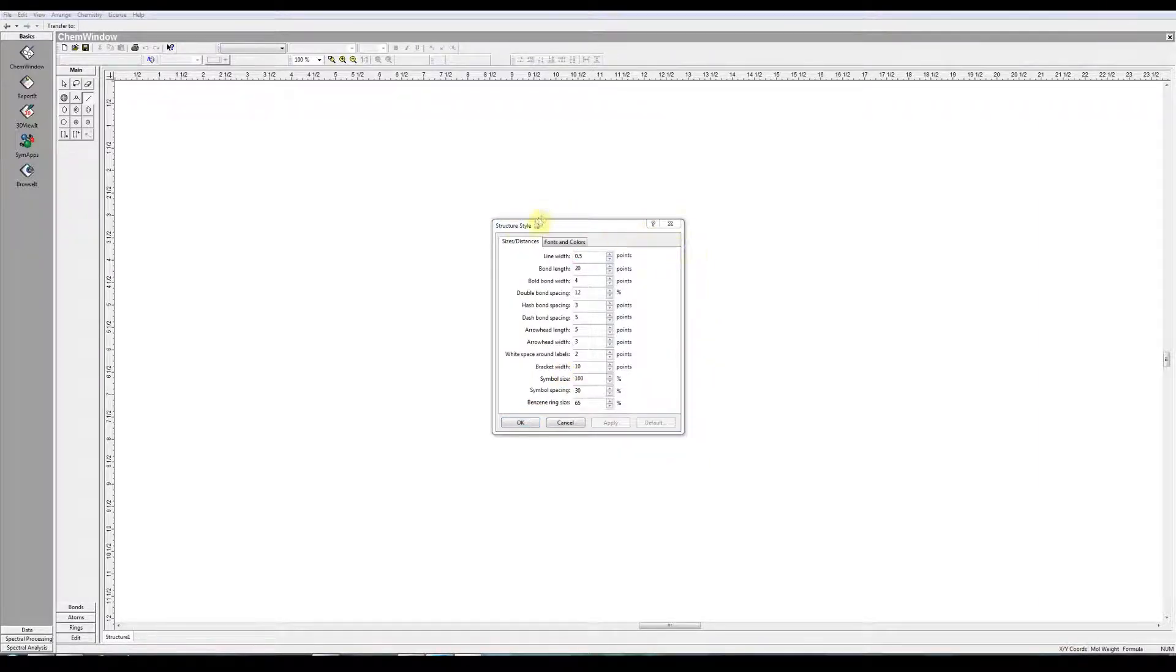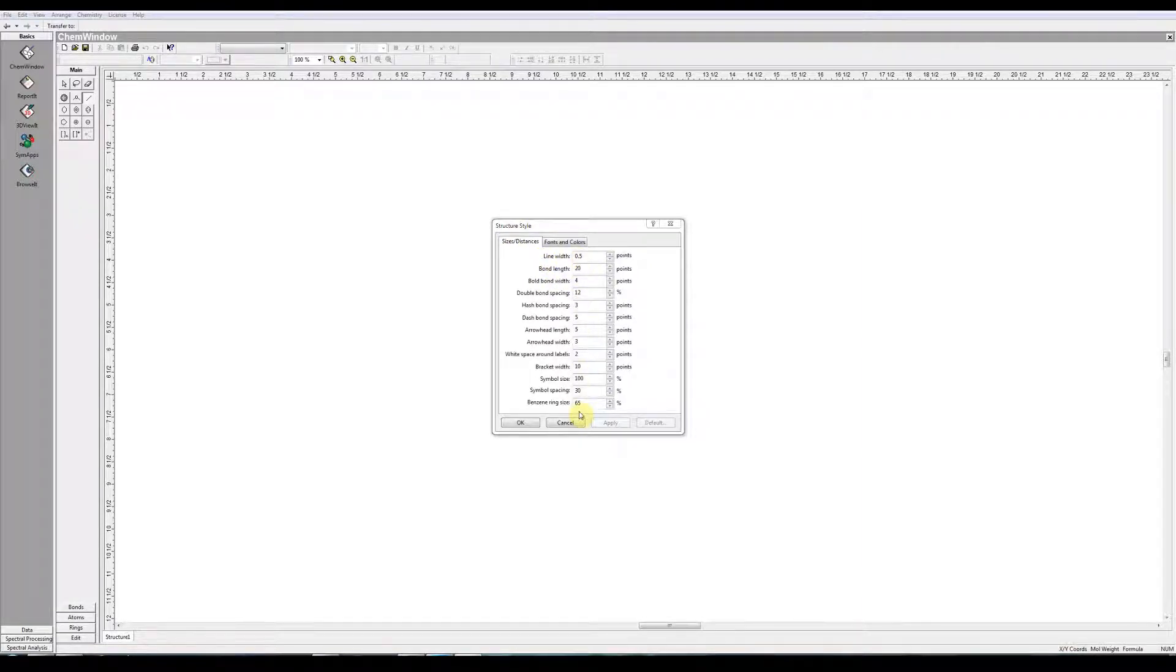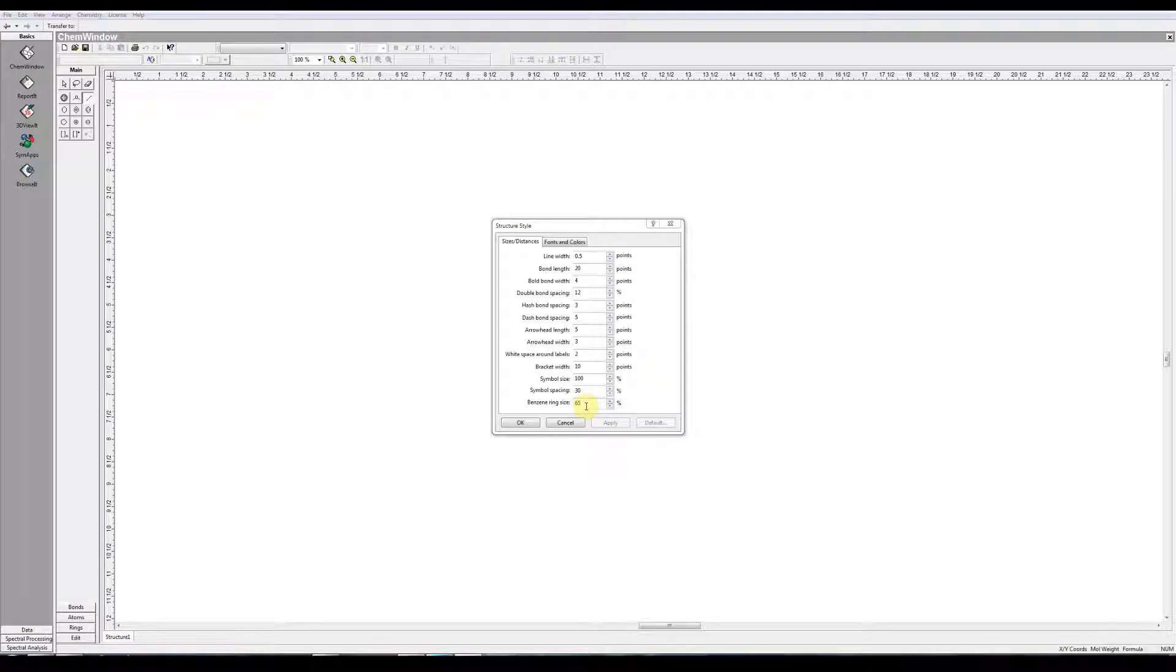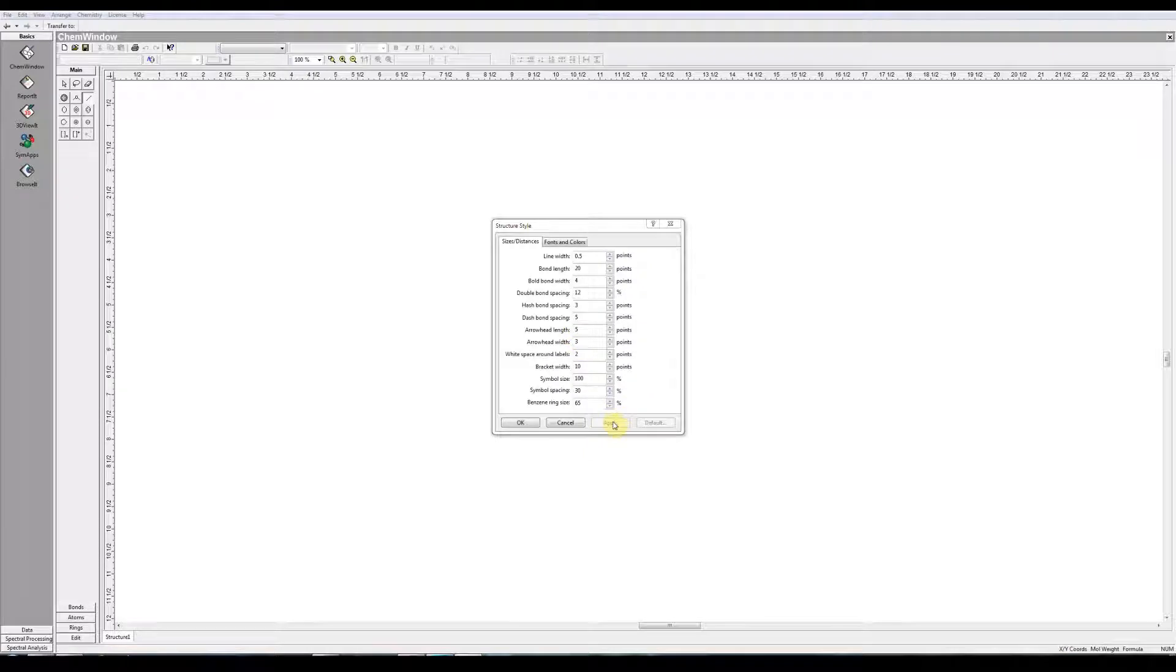Once you make a selection in this dialog box, everything you draw from this point forward will comply with these settings. But if there's a structure you have already drawn, and you want to make a change to it, what you'll need to do is select that portion of the structure, and then open this, and change the setting, and click Apply.